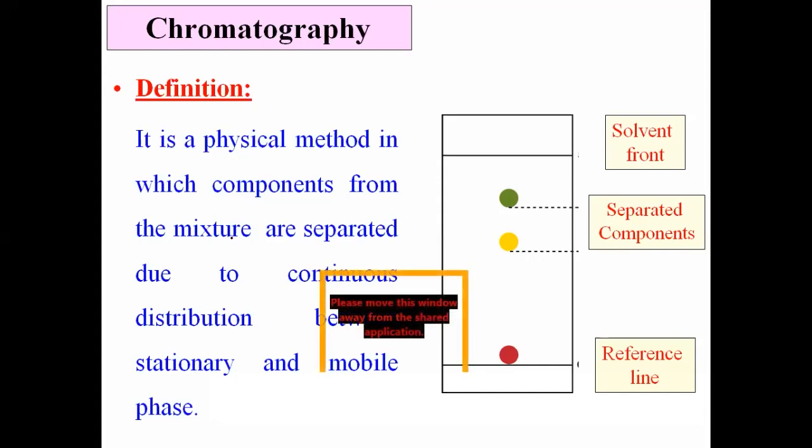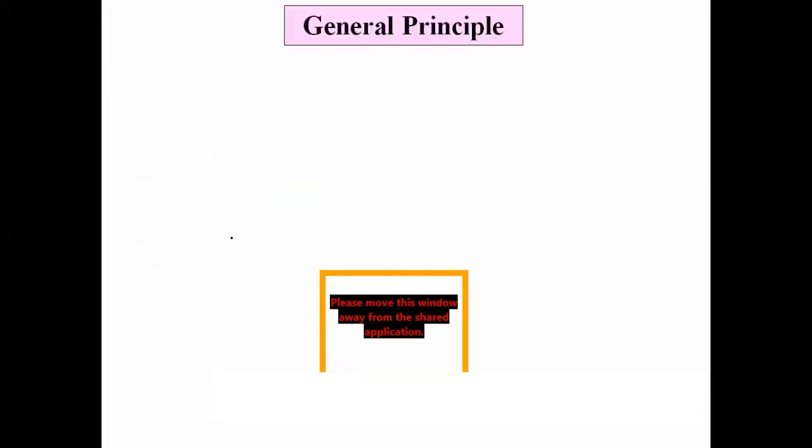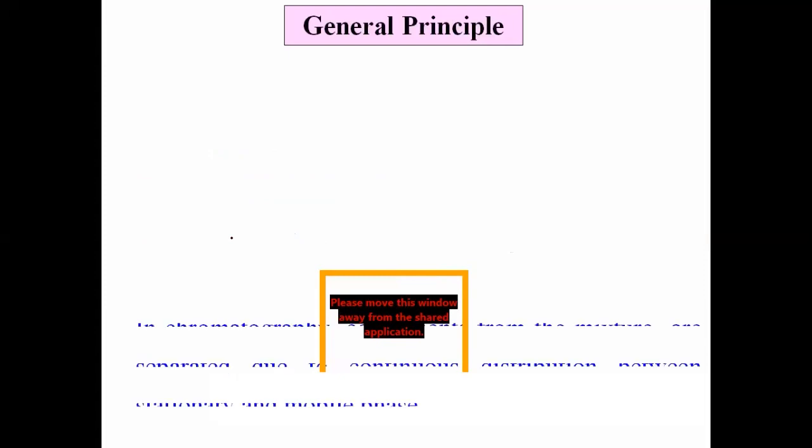This is just a definition for chromatography. Now let us see the general principle for chromatography. This is a very important part.